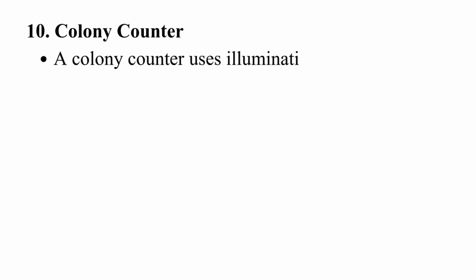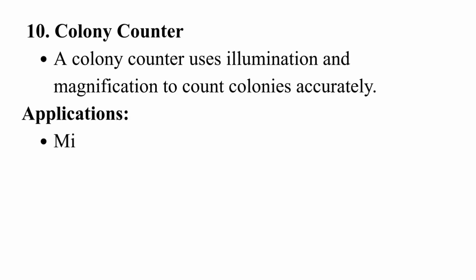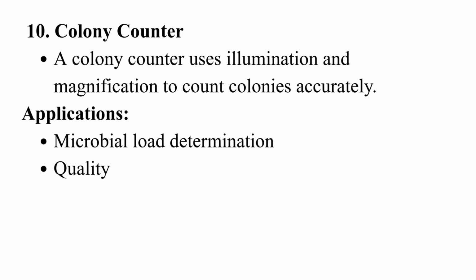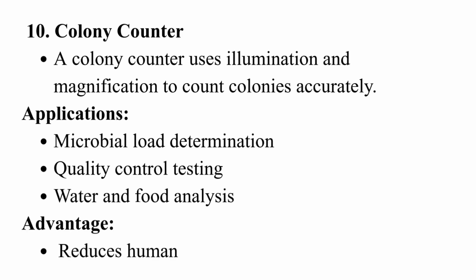Colony counter. A colony counter uses illumination and magnification to count colonies accurately. Applications: microbial load determination, quality control testing, water and food analysis. Advantage: reduces human counting errors.